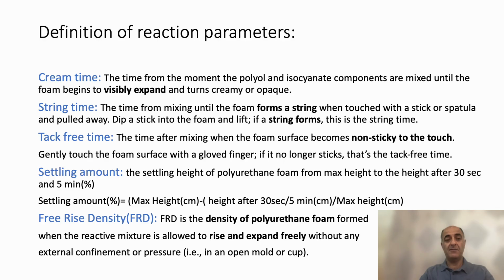For example, if the cream time is too short, you cannot fill the mold properly, and if the cream time is too long, it means the production time will be too long.